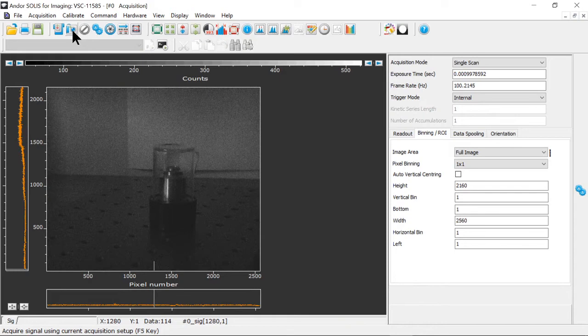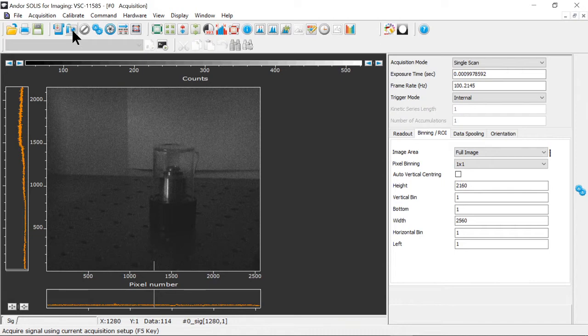Our cameras have very low readout noise, but each additional image added to an accumulation increases the effect of read noise. So here I'm looking at my scene with the short exposure time, artificially low in this case, one millisecond, to bring out the read noise and shot noise. Although I might need a short exposure for real if I was capturing something at high speed or recording a fast event associated with a pulsed light source.